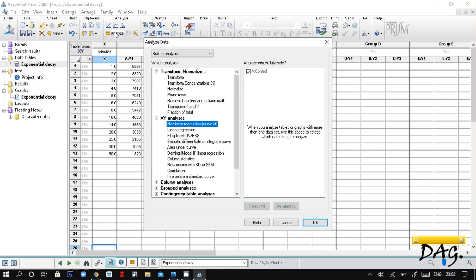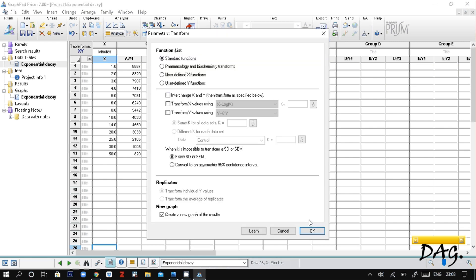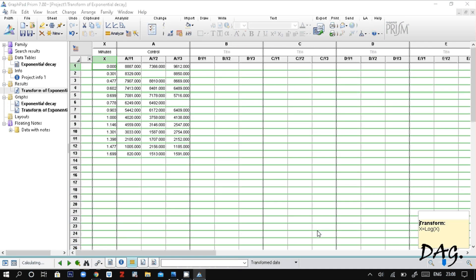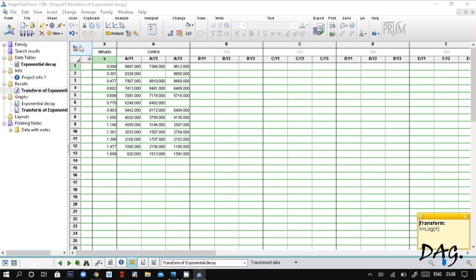Click Analyze, select Transform, then click Okay. Then select 'Transform X values' and make sure 'X equals log X' is selected. Click Okay. Now the x values are being log transformed.